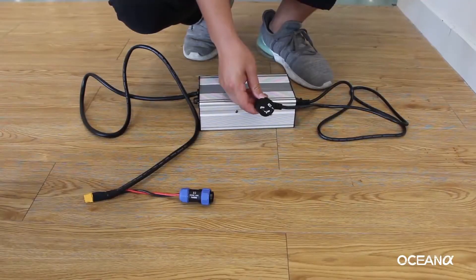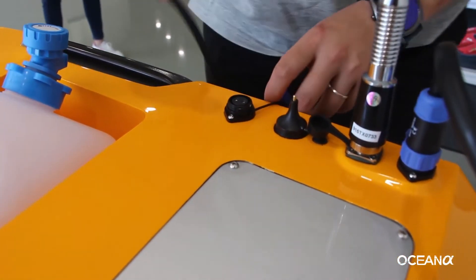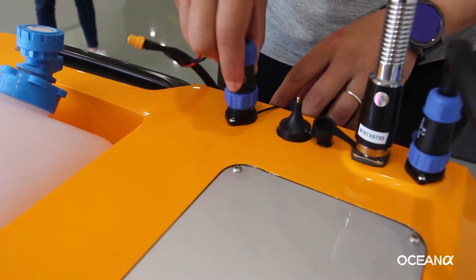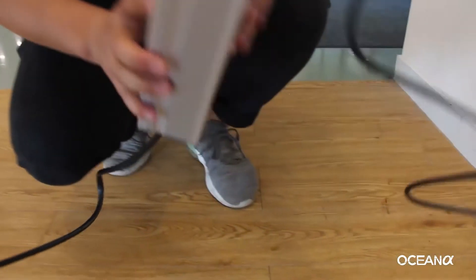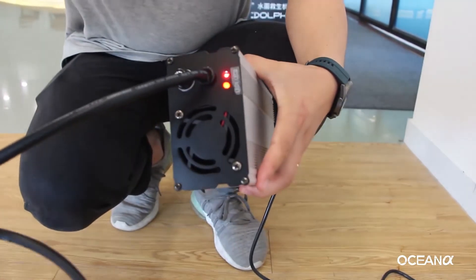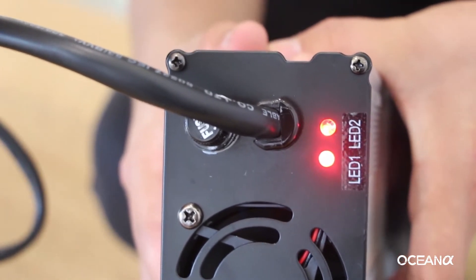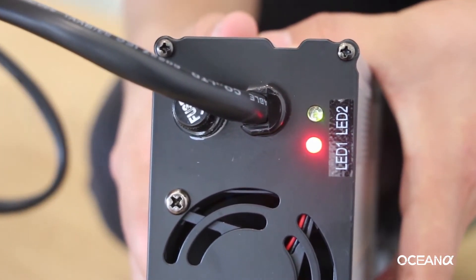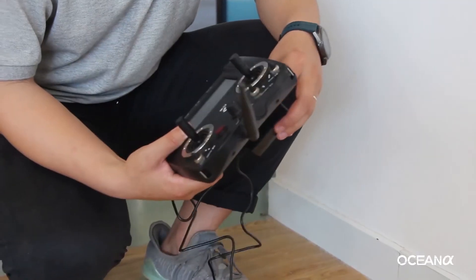Bolt charging: plug in the charger. Open the charging port and align the white dots to connect the cable. Turn on the charging button. The cooling fan starts working and the red light turns on — that means the bolt is being charged. When the cooling fan stops working and the light turns green, that means charging is finished.